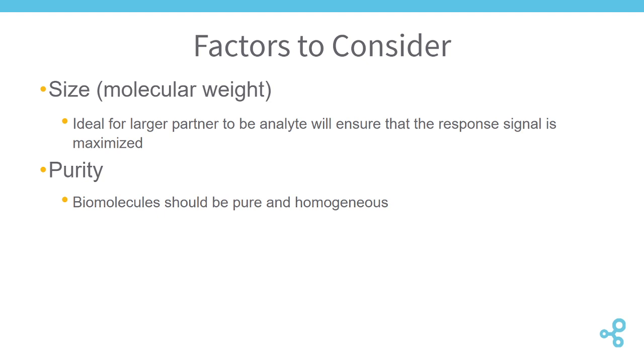Now, for instance, if we have a fairly pure mixture and we're using one of our coupling sensors, which we'll get to also in a bit, then we can potentially purify this further when we couple those to the surface, as anything without the tag that we'll be using for coupling purposes isn't on those other molecules in the solution. They'll just wash off the sensor.